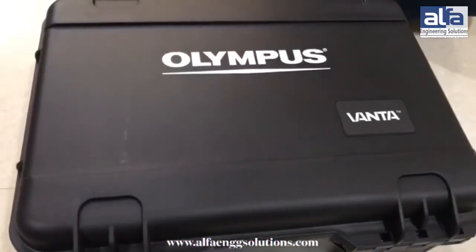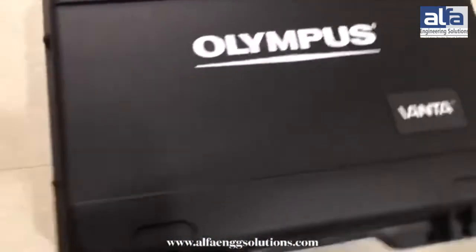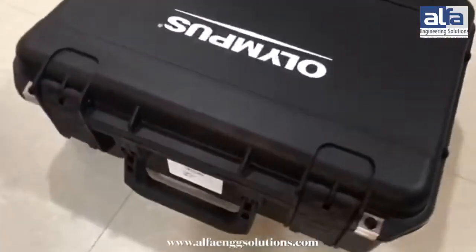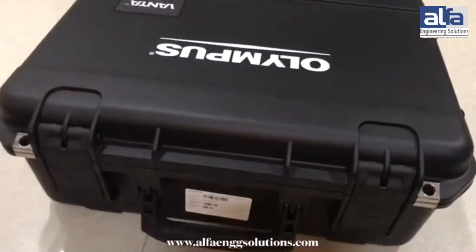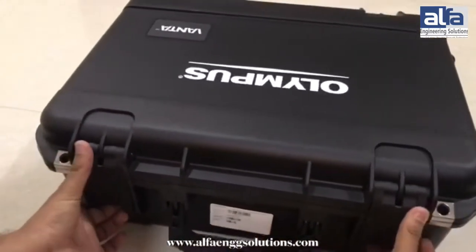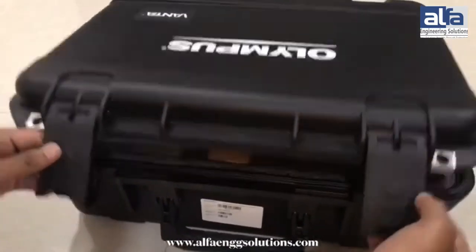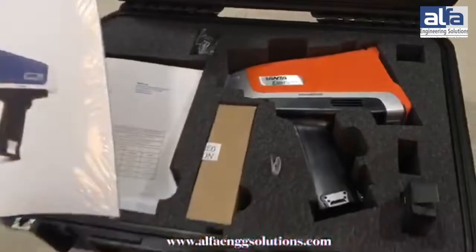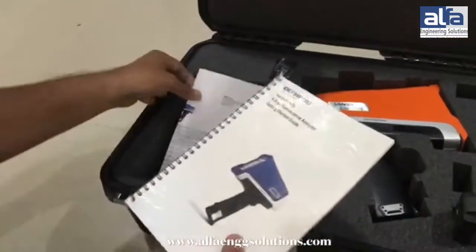This is the Olympus Vanta XRF Analyzer by Alfa Engineering Solutions. This is the working manual in which all the instructions are given on how to use this machine.